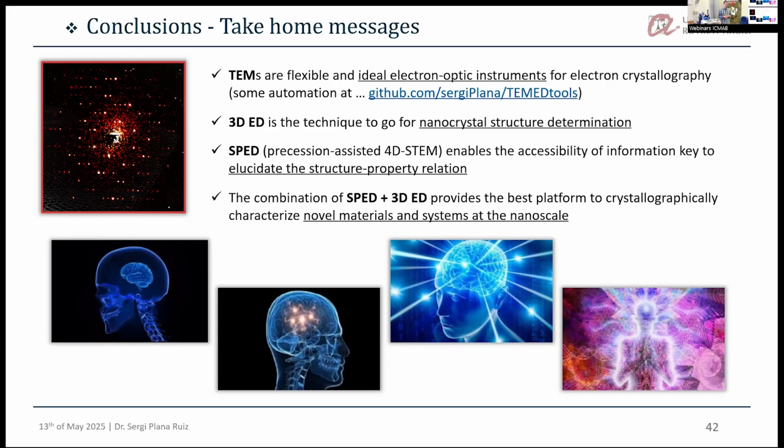I'm not sure. Taking into account only the classical approach of the Lorentz force, by seeing how it just moves the transmitted beam, this is okay. There is a quantum mechanical approach in which you can see that there is a momentum transfer inside the intensity of the beam.